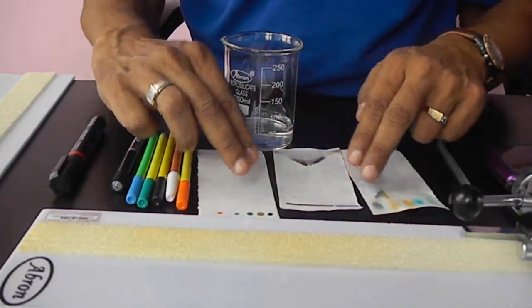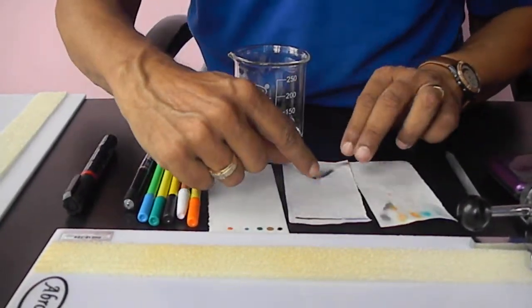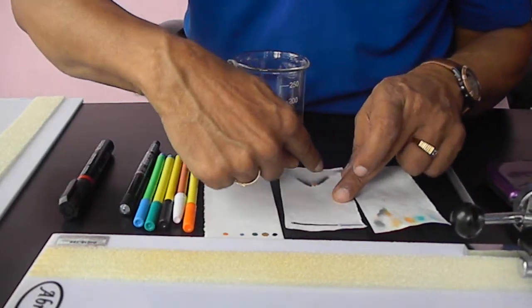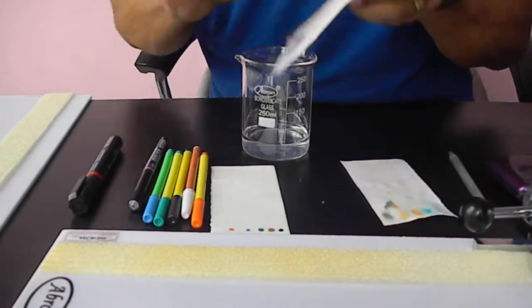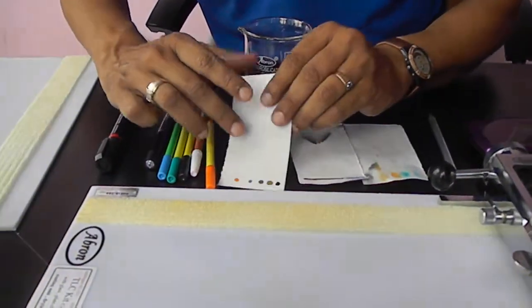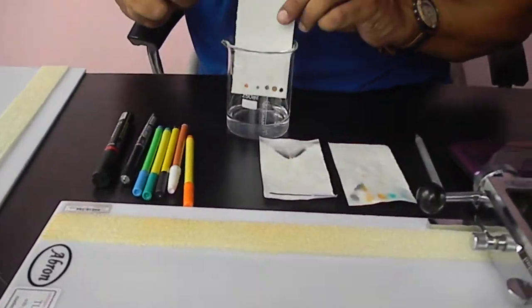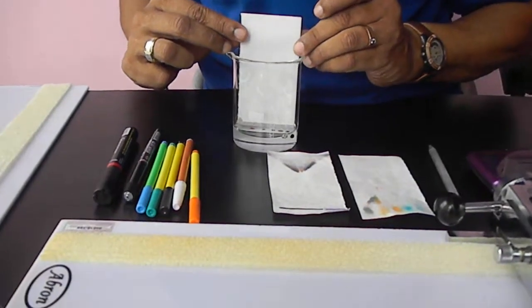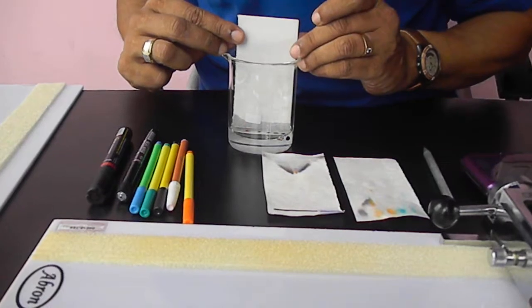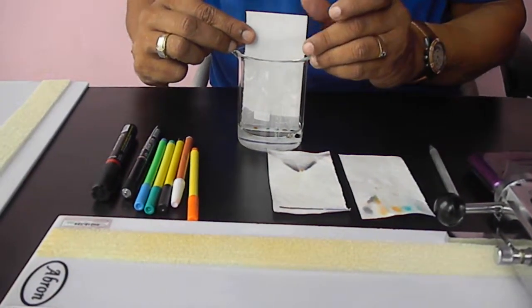When you put this inside the water, because I am doing it only with water, this spreading is there. In this, water soluble is there, not there. This black mark I did, kept it inside the water. Slowly you can see the changes. Now I am doing the same experiment, marking different spots with different colors. I am just putting it in the water. Now you see slowly this water is coming up, and slowly these chromatography colors will start dissolving, and this is pure water, nothing else.